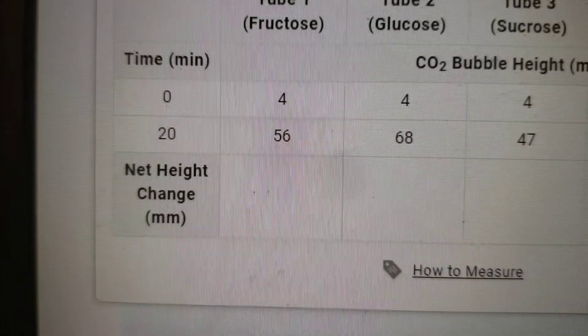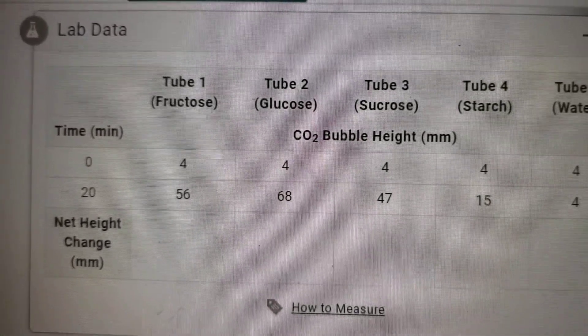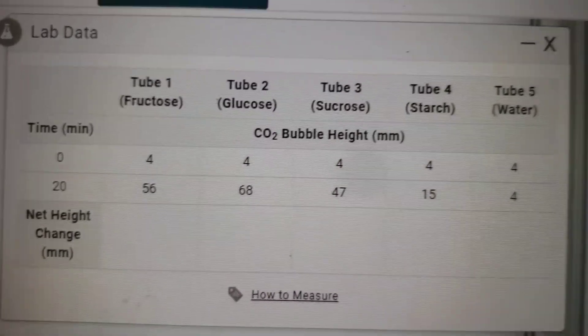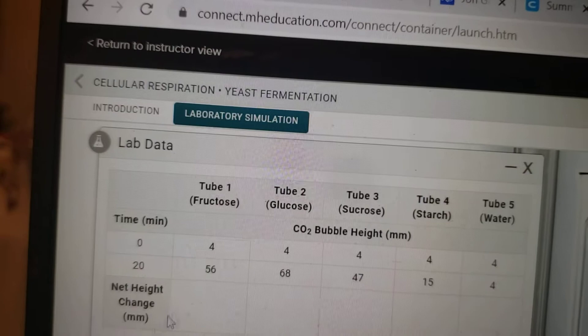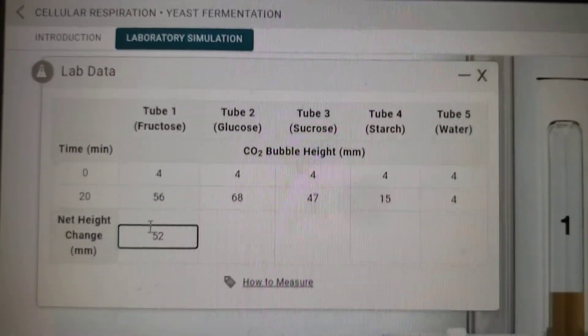So the height at zero minutes was four in tube one, the height at 20 minutes in tube one was 56. So 56 minus four is 52. Let's record the lab data, 52 millimeters.